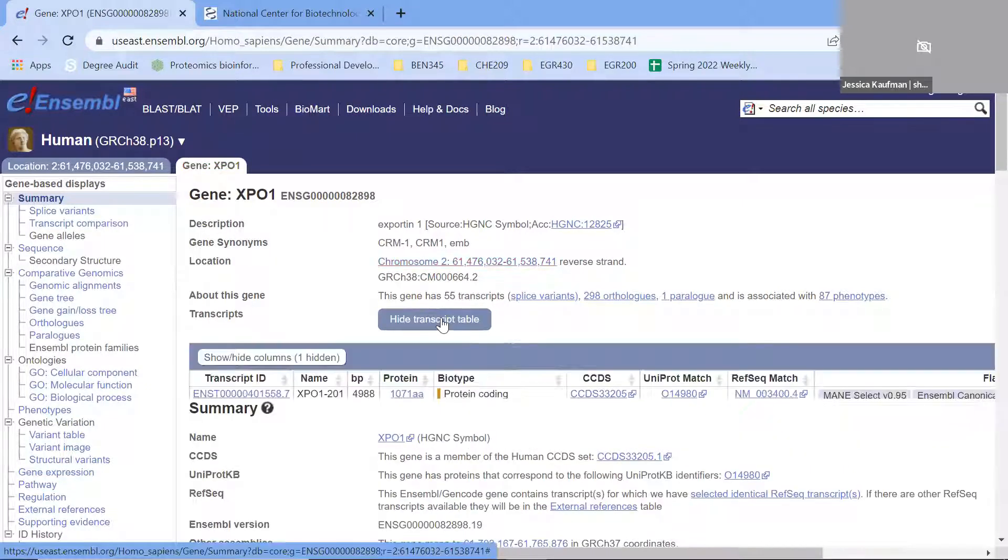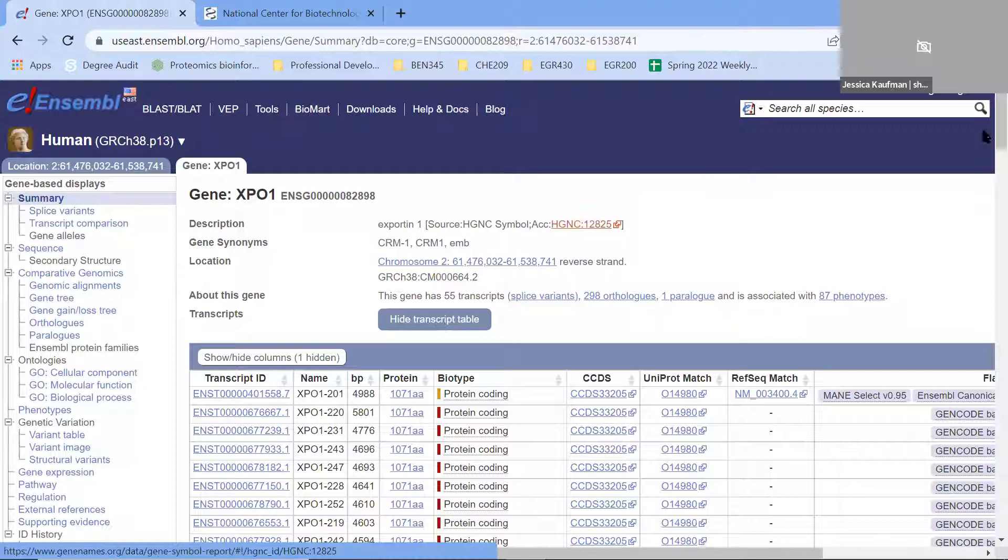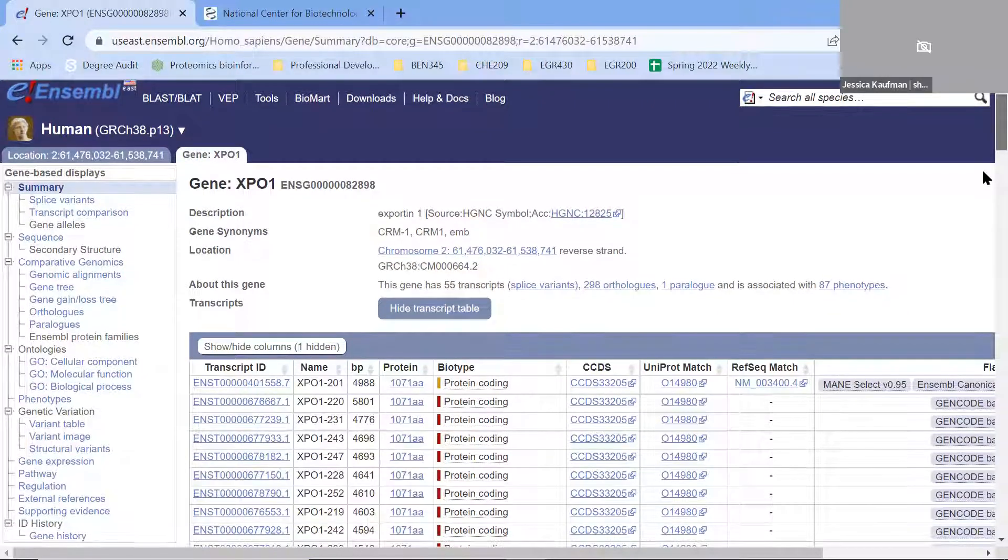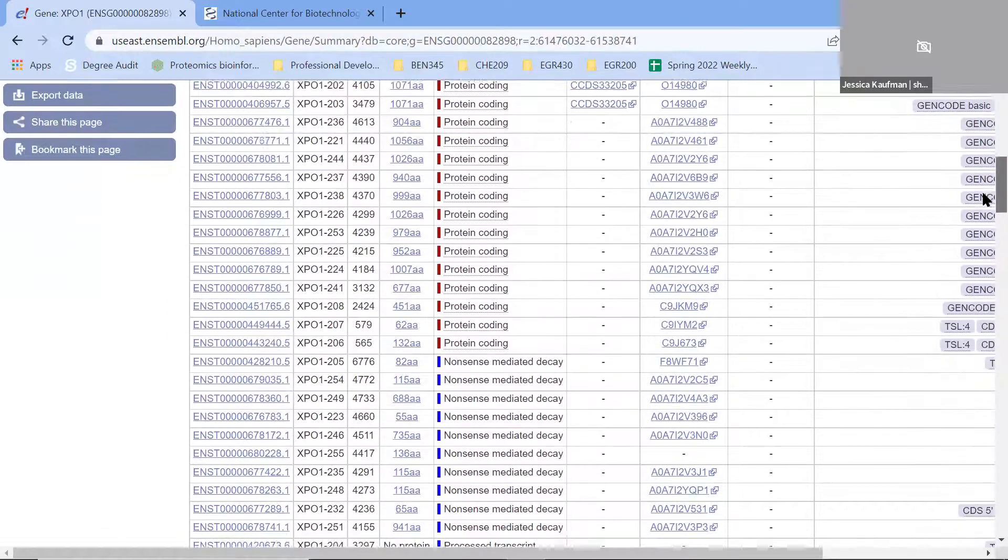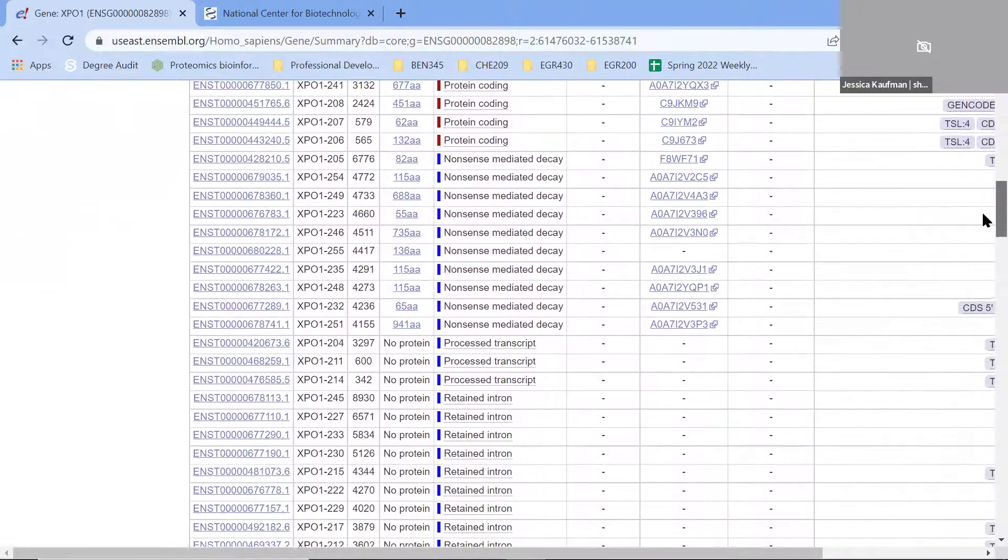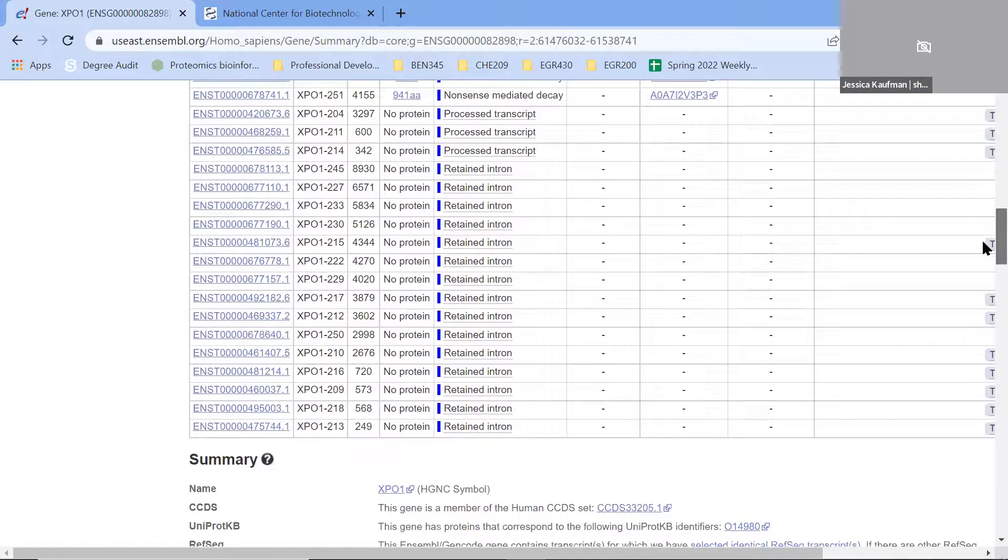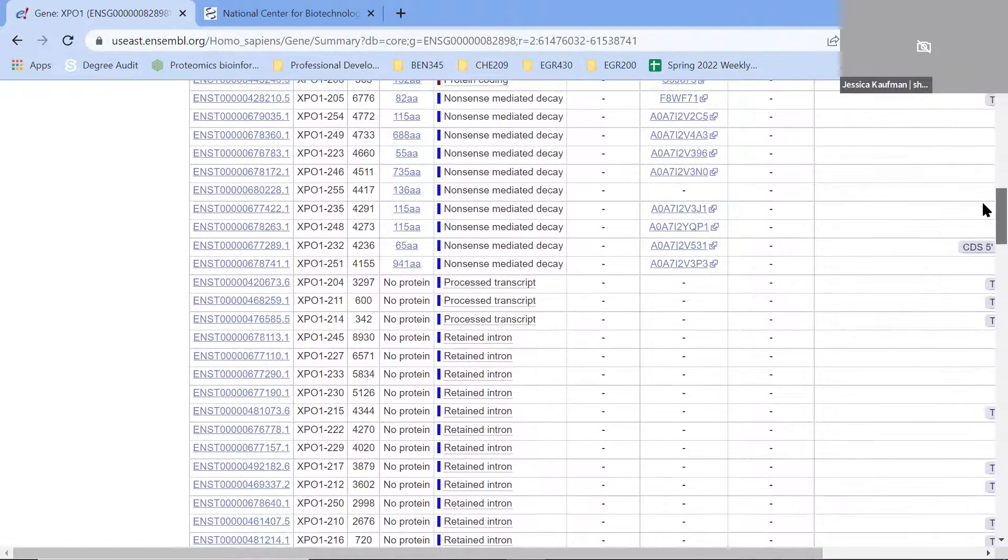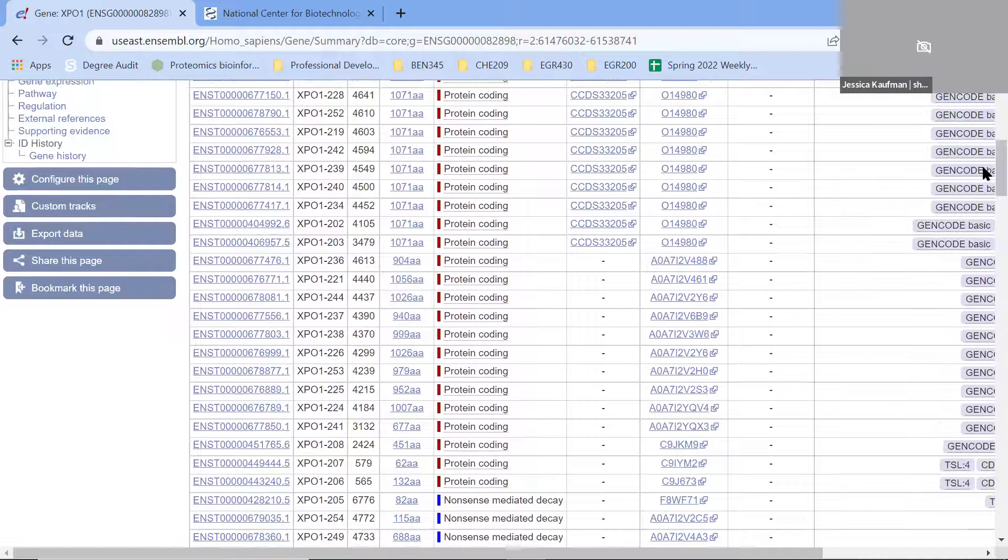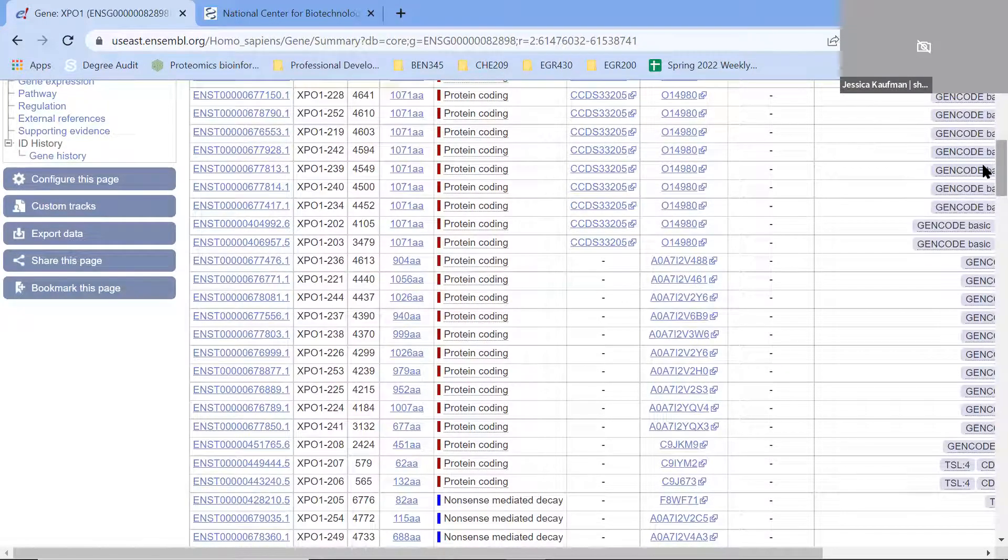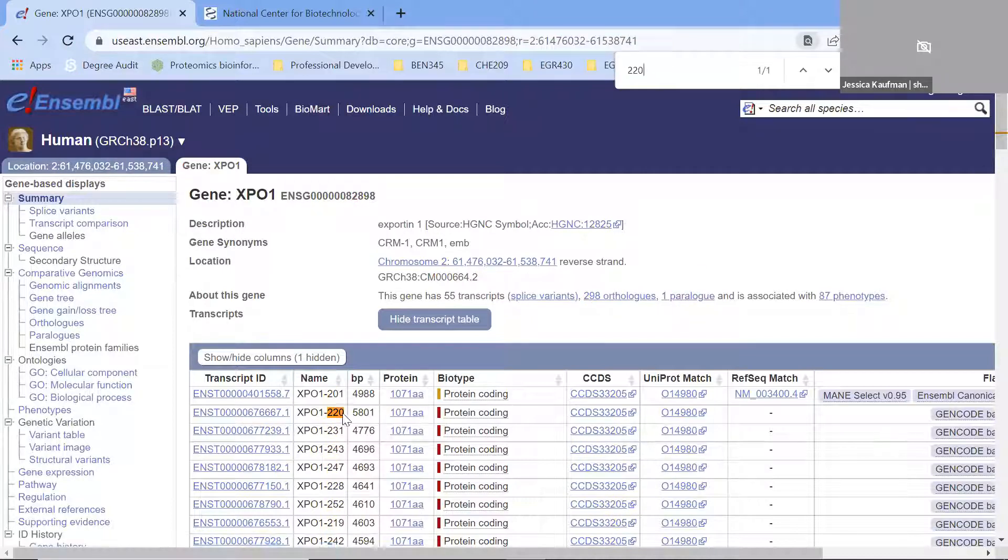I'm going to click on Show Transcript Table. That will be the easiest way to view all the transcripts. The assignment for this week asks you to look at Transcript 220. If you scroll down, you can see all the different XPO1 numbers - XPO1-222, XPO1-241. We're looking for 220, which is the second one.